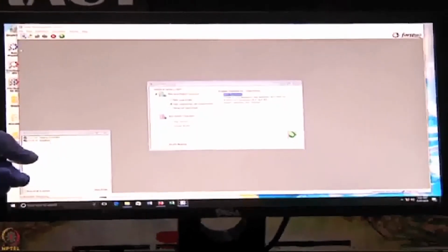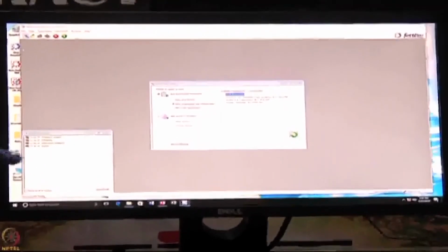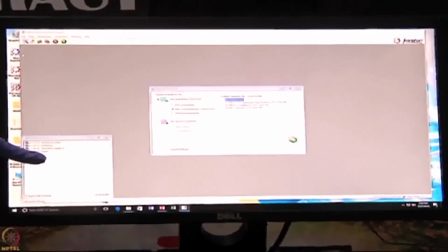It will go through XYZ direction alignment, then the message will come as ready. It says roughly 30 seconds for initialization. Now you can see that the instrument is ready, so we can start the experiment.